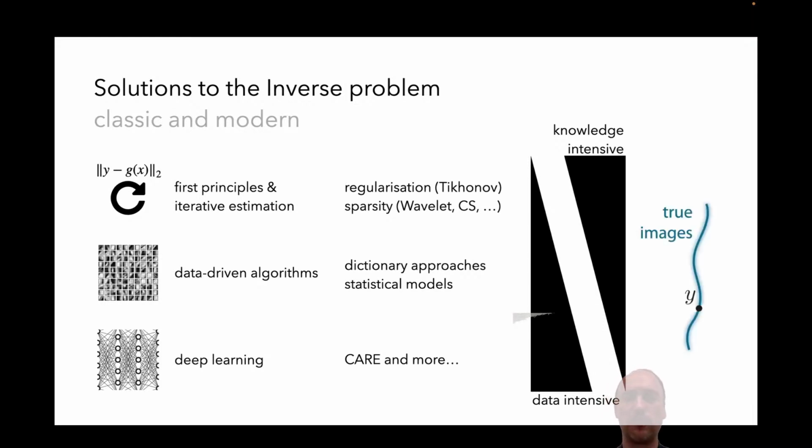And really the way to understand this is that all these approaches really rely on the abstract prior, which is this space of true images that you're trying to characterize. What is a reasonable solution for the denoising problem? So in the past, in the case of the first iterative approaches that involved solving some optimization problems, you had to characterize that space.